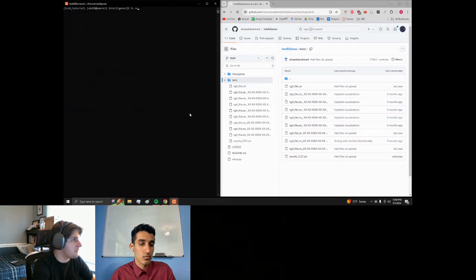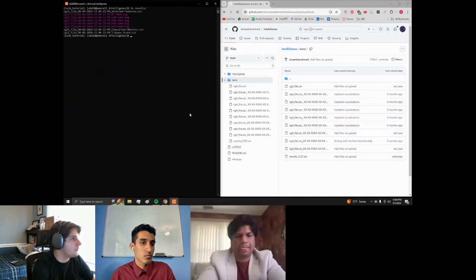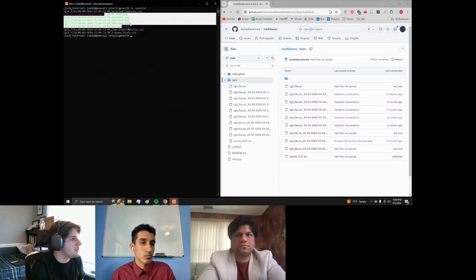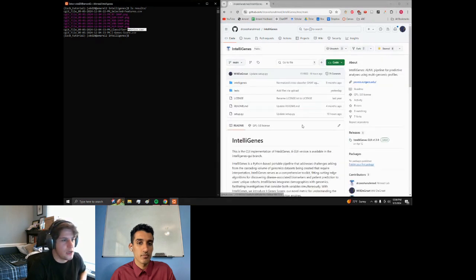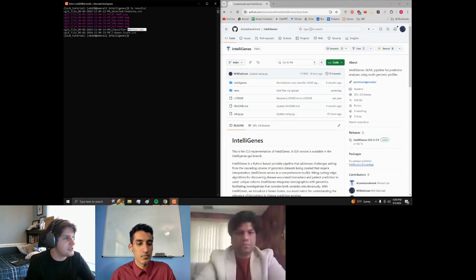So let's navigate to that results directory and see what we have. From the results directory, we have the selected features, the visualizations, the classifier metrics, and the IGene scores, as already showed off by Rishabh. If you are interested in using the CLI implementation, this is how you do so. And I believe with that, we will turn it over to Dr. Ahmed to close us out. If there are any questions about either of the versions, feel free to ask.